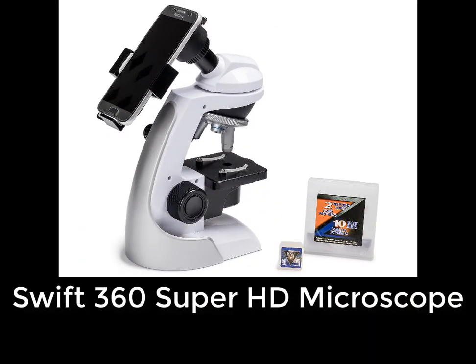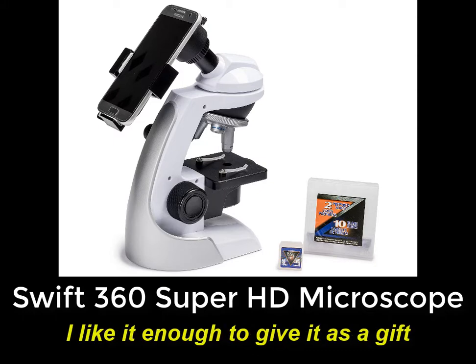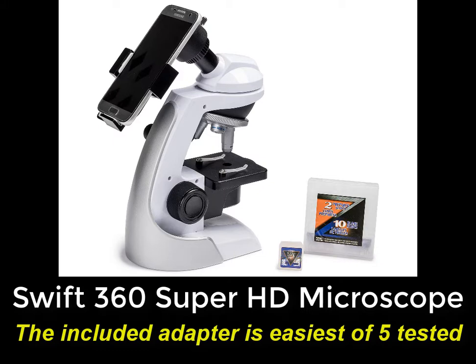So, what's the bottom line? It's not a terribly expensive microscope, and I do like it enough to give it to one of the families with children in my neighborhood — and that's saying something, given the fact that I have historically discouraged parents from buying compound microscopes up to now. I do love the idea of the all-in-one package with both microscope and smartphone adapter in one box. That's very convenient, and the included adapter is the easiest to use of the five I have tested.